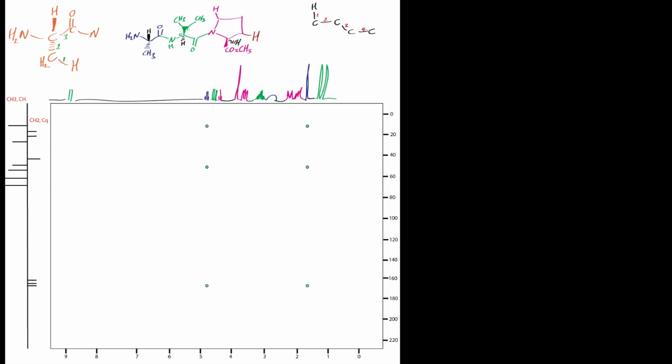So we've just looked at alanine, the signals from alanine. We know we've got a proton, remember it's a proton observed technique, so we've got the alpha proton there. We've also got protons in the methyl group there, and I'm not going to worry at all about the NHs. So we're just going to look at the ones that are connected to carbon for now. So we look at the alpha proton.